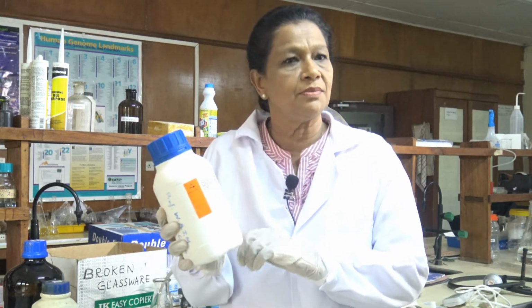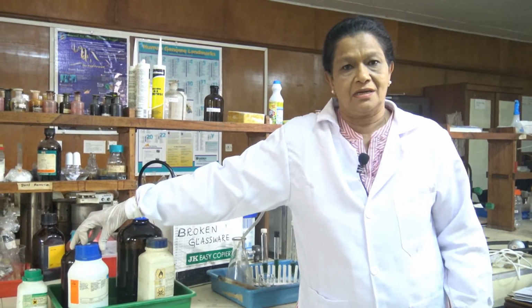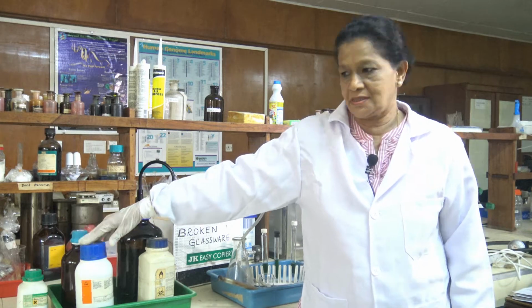These can enter into the body through dermal absorption. The health effects of these are wounds, itching, burning sensation and sometimes breathing difficulties.